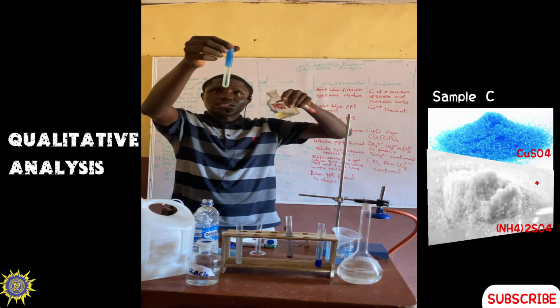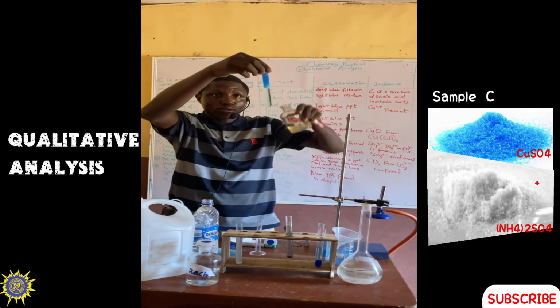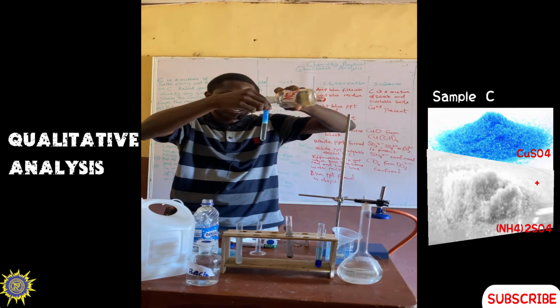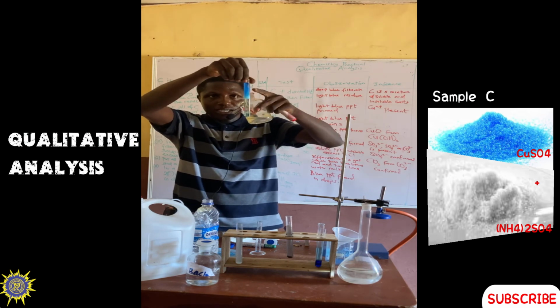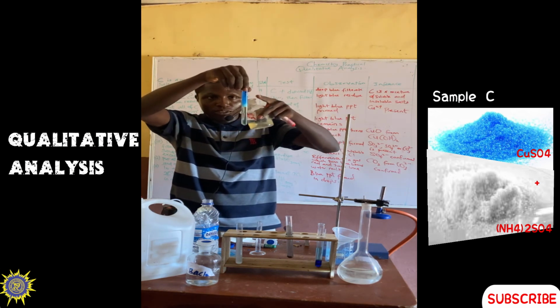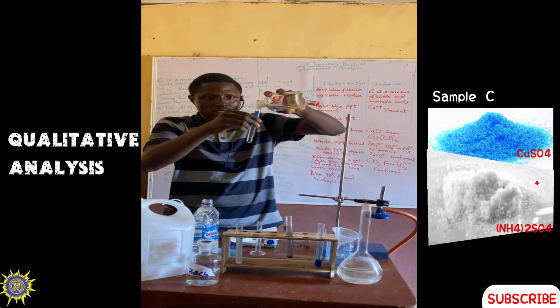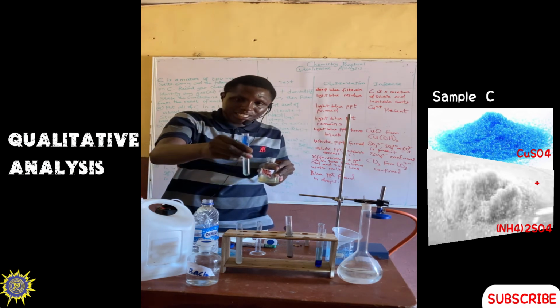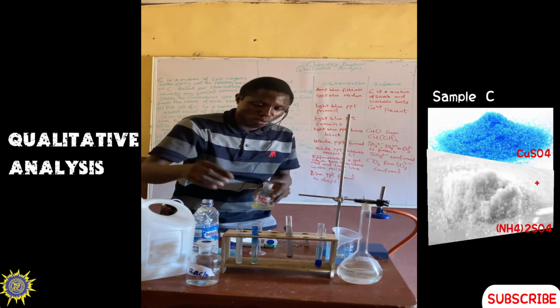You can see in excess now, the blue precipitate has dissolved to form what? Deep blue, if I continue to add it. So you can see the blue formation, and that's how it will be dissolving. The blue will be continuing to dissolve. Let me add a little. So that's what it is. So we can see a deep blue.